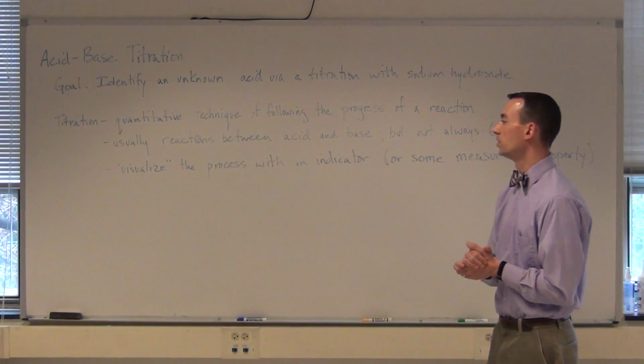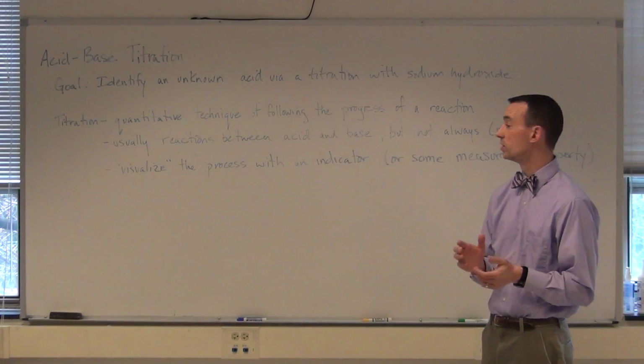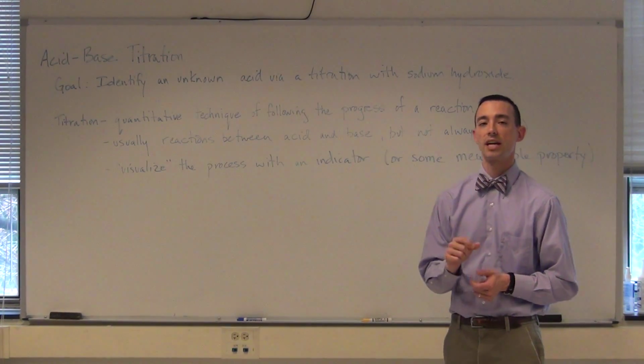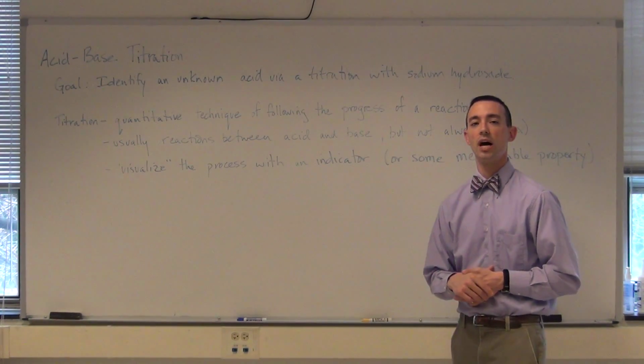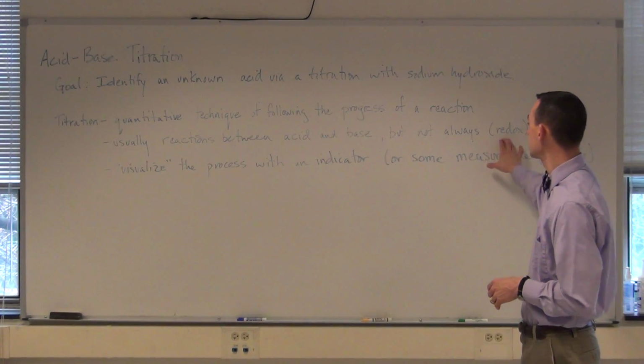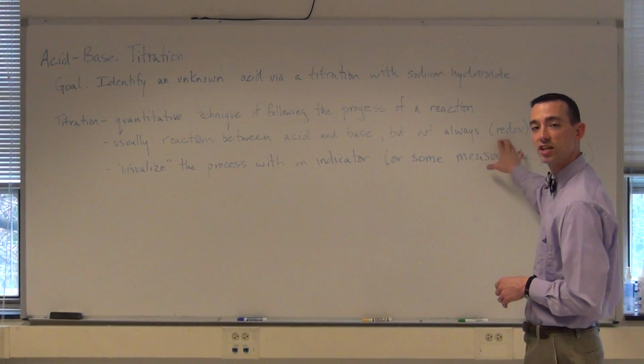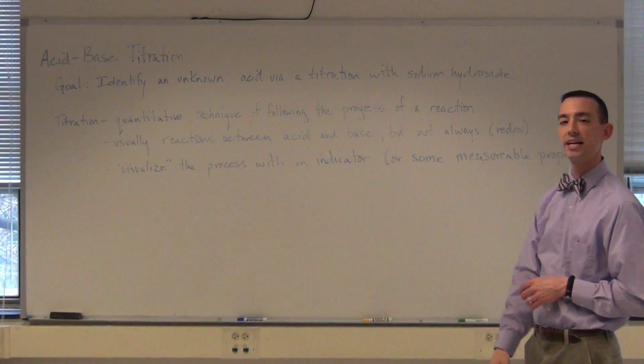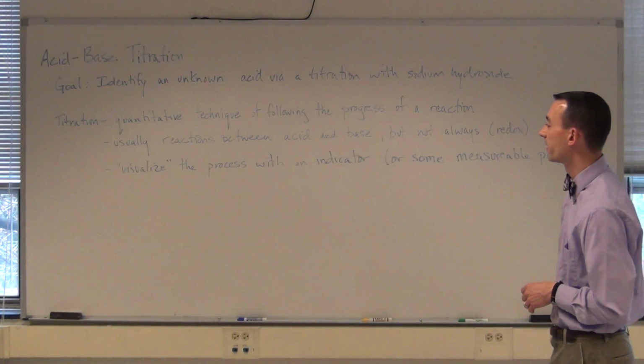Now usually titration is used for acid-base reactions, but that's not always true. And again, if you completed Chem 1 at York College, you did a redox titration with bleach as part of your curriculum for Chemistry 1. So you're familiar with applying this technique to some other areas.